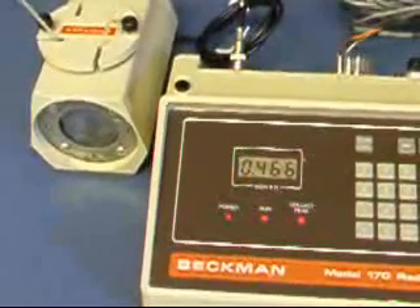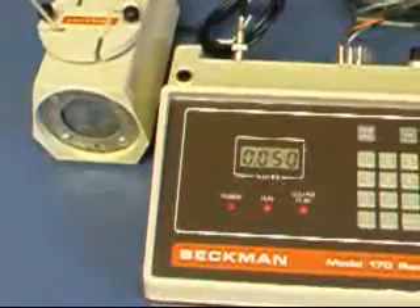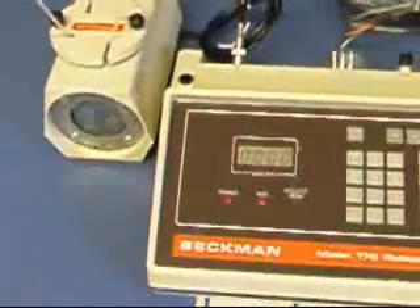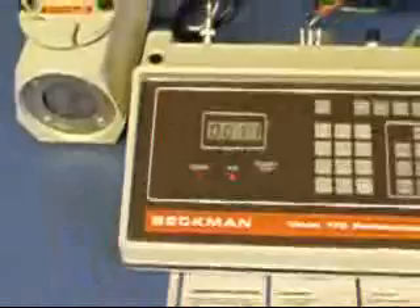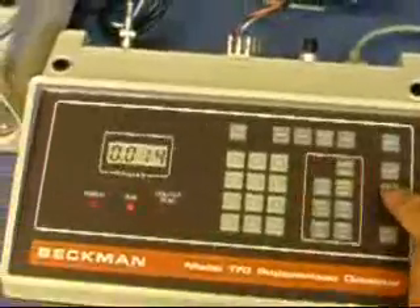The scale goes right back down to background level. I'm going to press the stop button.